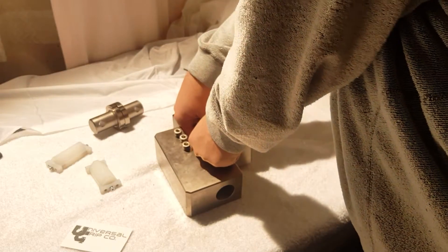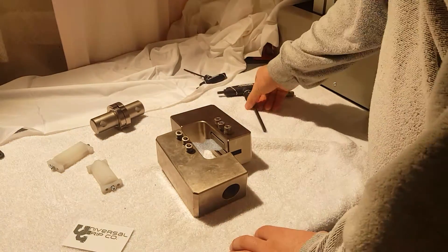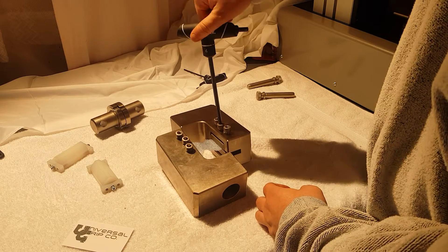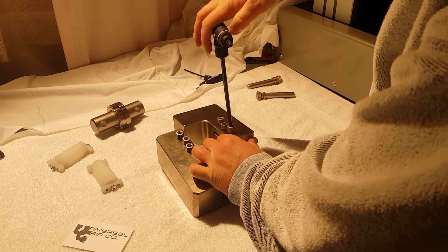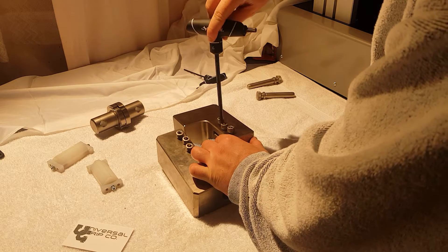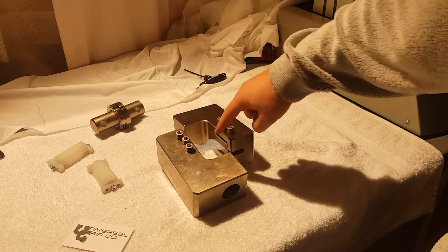A lot of people when doing this test will not only get values from the machine for both load and displacement, but it's also common to place a sensor directly onto the sample — a little strain gauge. What that does is give you more accurate displacement data right at the shear face, which is where we're testing.